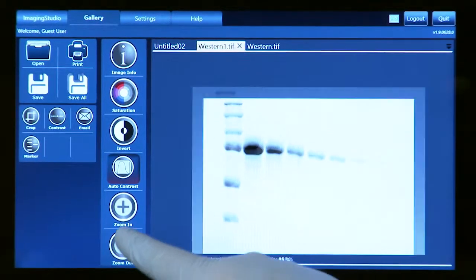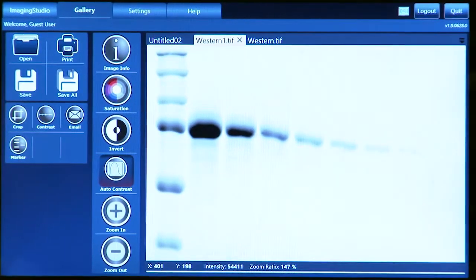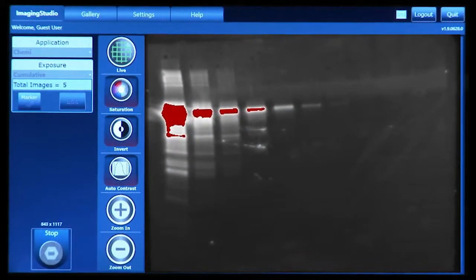After you take an image, there are several ways you can view and process it. Zooming in and out is straightforward and fast, and you can use a touchscreen to easily pan around your image. Touching on any point of the image will show its intensity level at the bottom. Touching the saturation button will show whether or not your image is saturated.